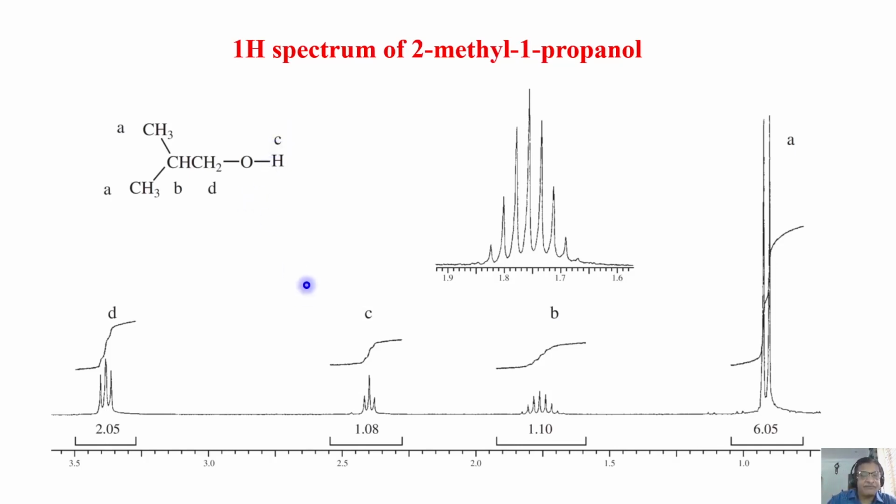Let us look at the spectrum, whether there is a triplet. Of course, there is one triplet here. There is also another triplet here. Triplet-like, not exactly a triplet. Please remember, the triplet intensity pattern is 1:2:1. But do they look like that? If you carefully see, it is not a triplet, it looks like a doublet of doublets with some extra splitting in the central peak. It will appear the central peak is also split. It is not clearly visible here. The only very clear triplet pattern is seen here.